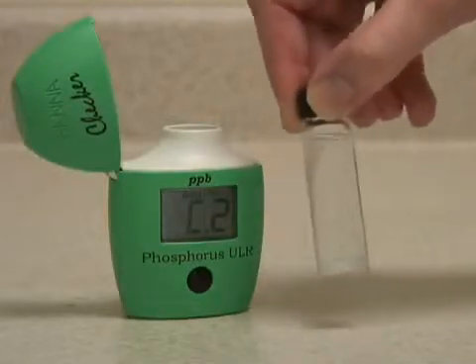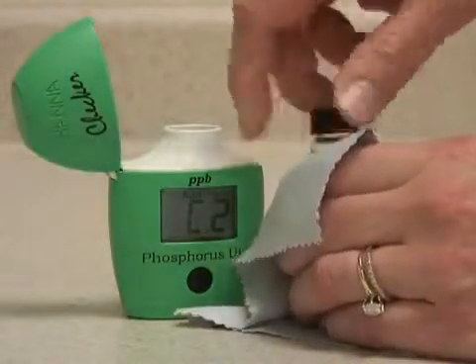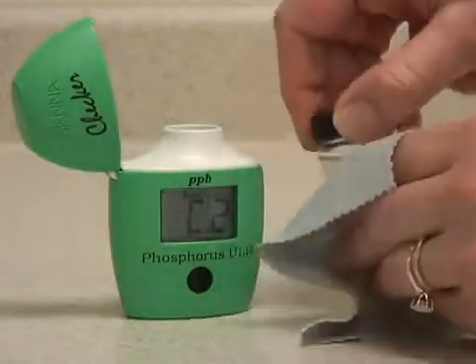You may also want to clean the glass with one of our static-free cleaning cloths to remove any fingerprints or smudges.